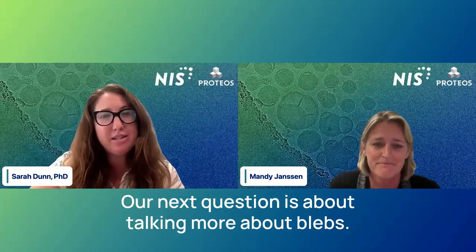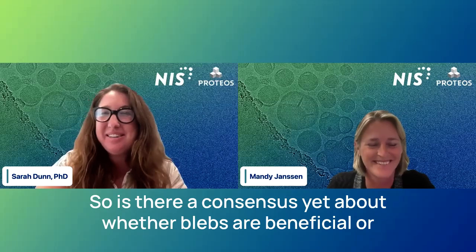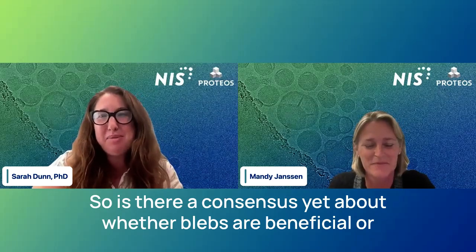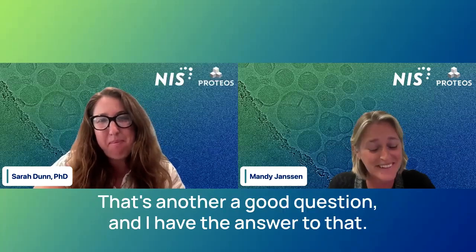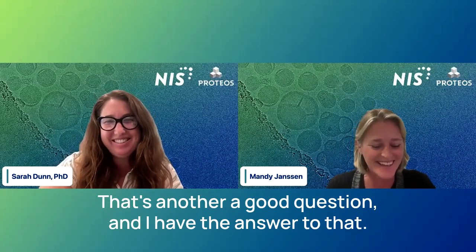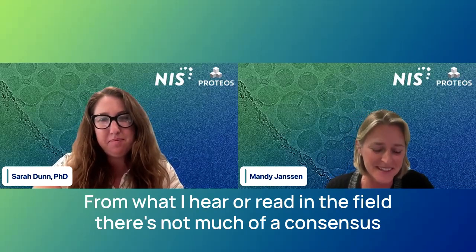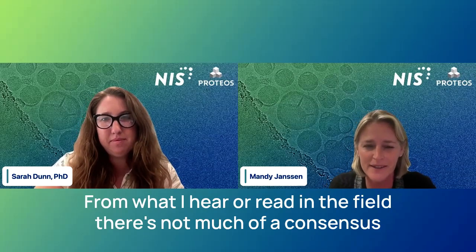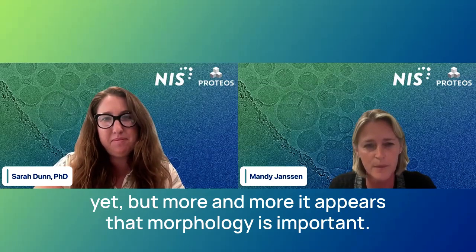Great. Our next question is about talking more about blebs. So is there a consensus yet about whether blebs are beneficial or detrimental to particle potency? Yeah, that's another good question, and I wish I had the answer to that. From what I hear or read in the field, there's not much of a consensus yet, but more and more it appears that morphology is important.